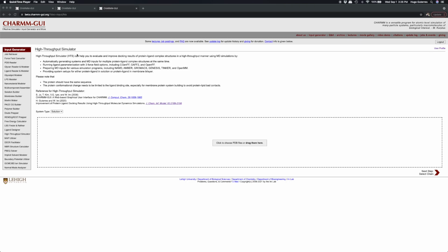This video demo will demonstrate the general functionality of High-Throughput Simulator in CHARMM-GUI. HTS automatically prepares simulation systems of multiple protein-ligand complex structures in a high-throughput manner to facilitate structure-based drug design.